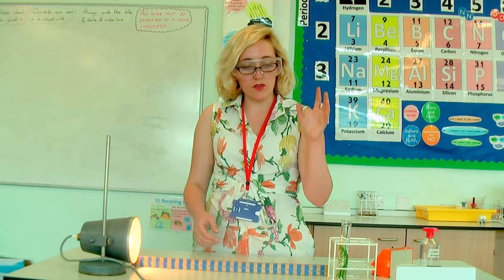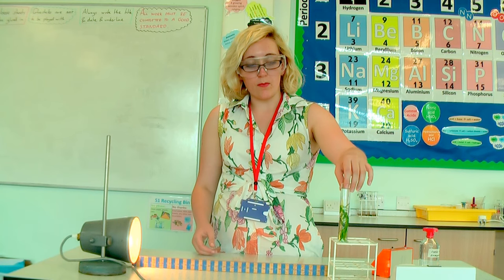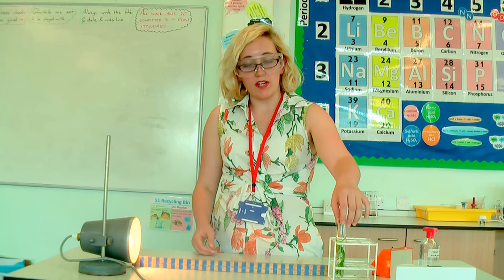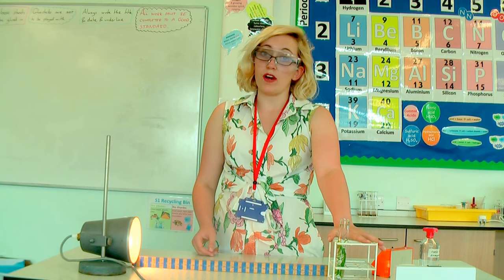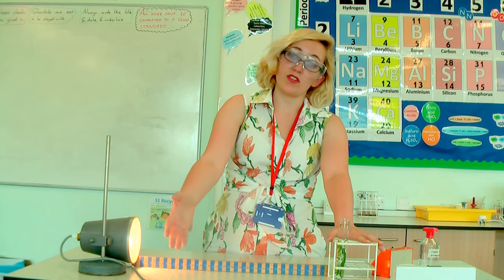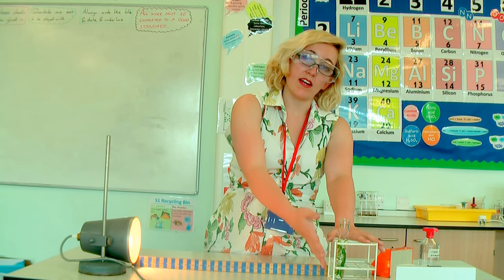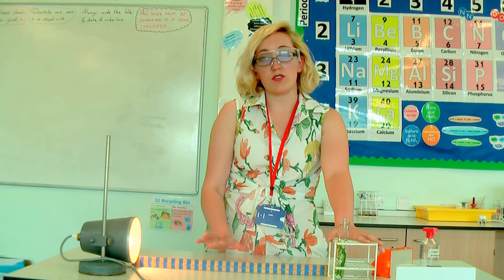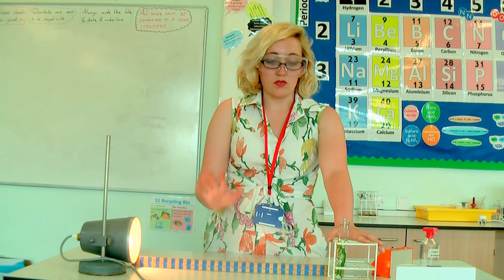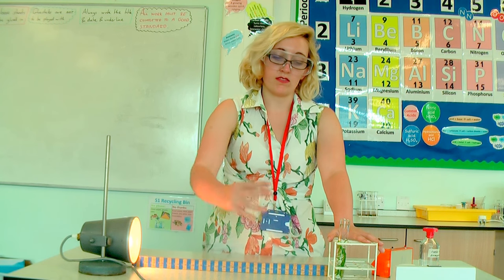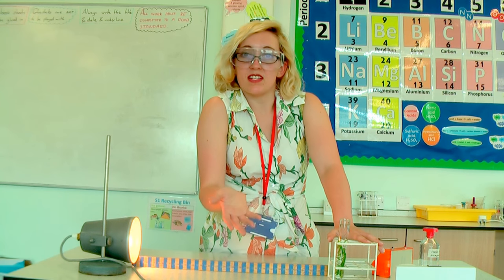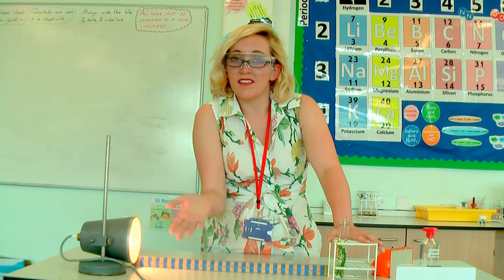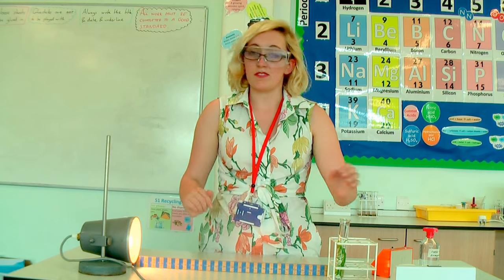So I've got my pondweed in my boiling tube. I'm using this kind of test tube rack just because it doesn't block any of the light going onto my boiling tube. Be careful when you're doing it — you do not want something in the way of the light here, because then what's the point? There is no distance difference.